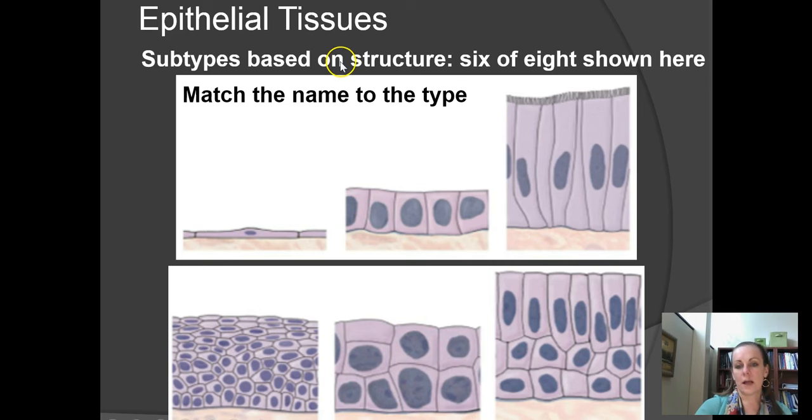to our different types, simple versus stratified, here's white space, so here's the surface, here's epithelial tissue, and you can see here we've lost our closely spaced nuclei, so now we're into connective tissue. Okay, so at this point, connective tissue, connective tissue, connective tissue, all right, on each of them. So if it's a simple tissue, epithelial tissue, that means you will go through one layer of cells. Okay, so again, but here if we look, we're going into epithelial tissue. Well, we pass 1, 2, 3, 4, 5, 6, 7, 8, 9, at least, a whole bunch of layers of cells before we get down to connective tissue. So you should ask yourself which of these are simple, which of these are stratified, based on how many layers of cells that you're going through.